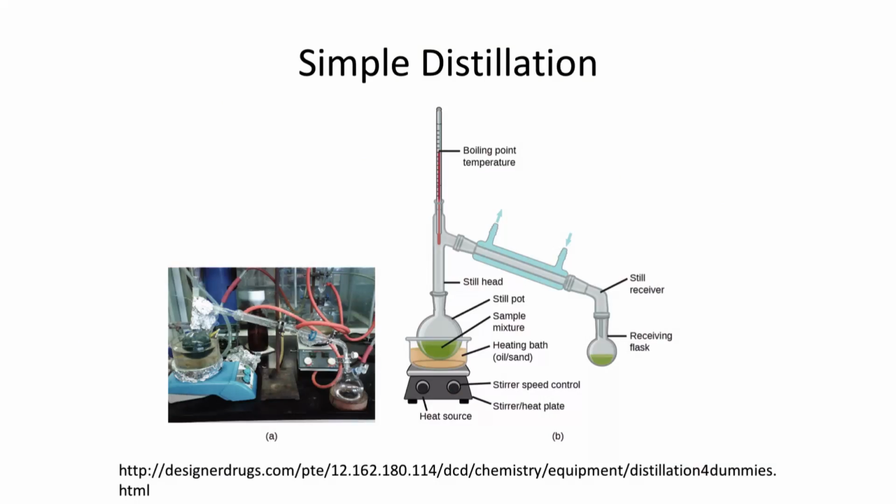So the condenser, as the name implies, condenses the gas. The condenser is really just a tube inside of another tube. And on the outer tube, I have water that is circulating across the condenser, cold water that circulates around the condenser. Okay, and so water goes in over here, water goes out over there. And the idea is that I have vapor being produced this way, which is hot.